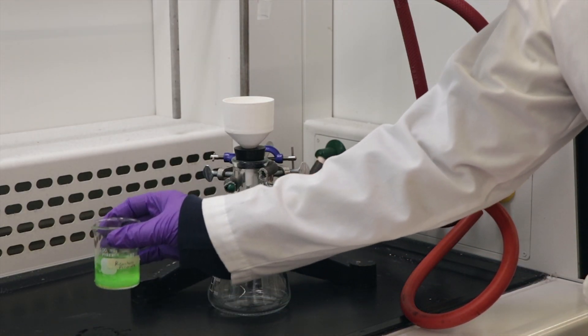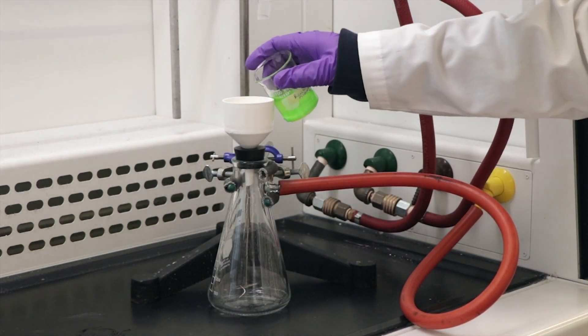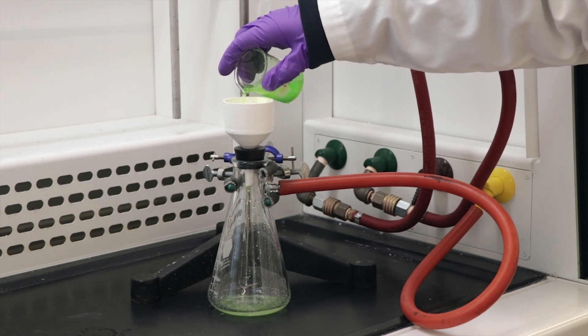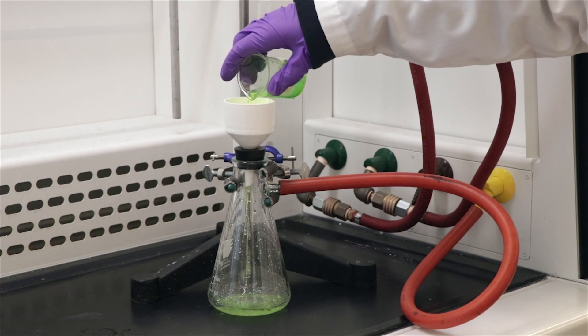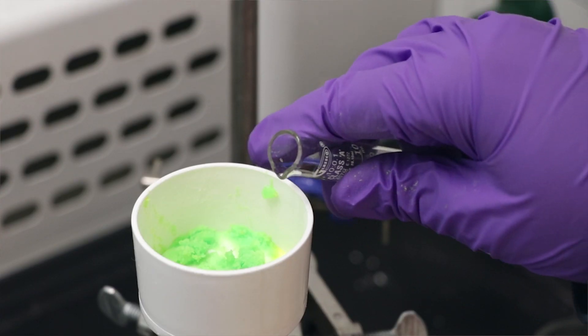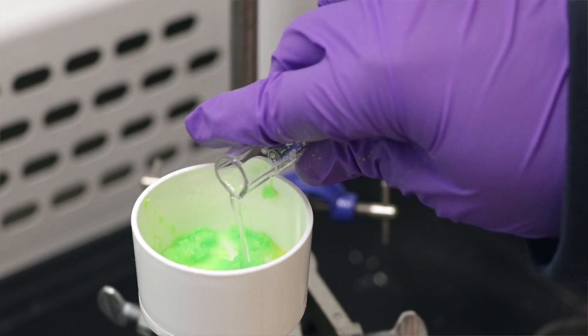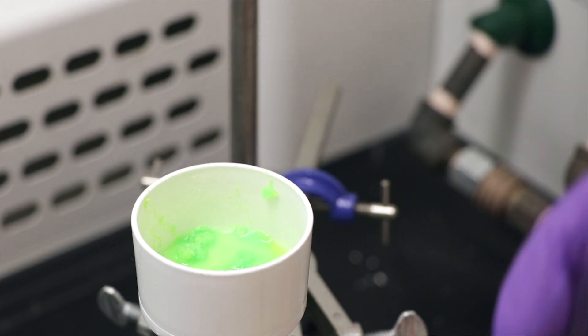Once your product has precipitated, you can now proceed to filtering it. Pour your crystals through the Buchner funnel while the vacuum is on and let your crystals dry. Once your crystals dry, add a few milliliters of ethanol to your crystals uniformly to wash them from any excess filtrate.